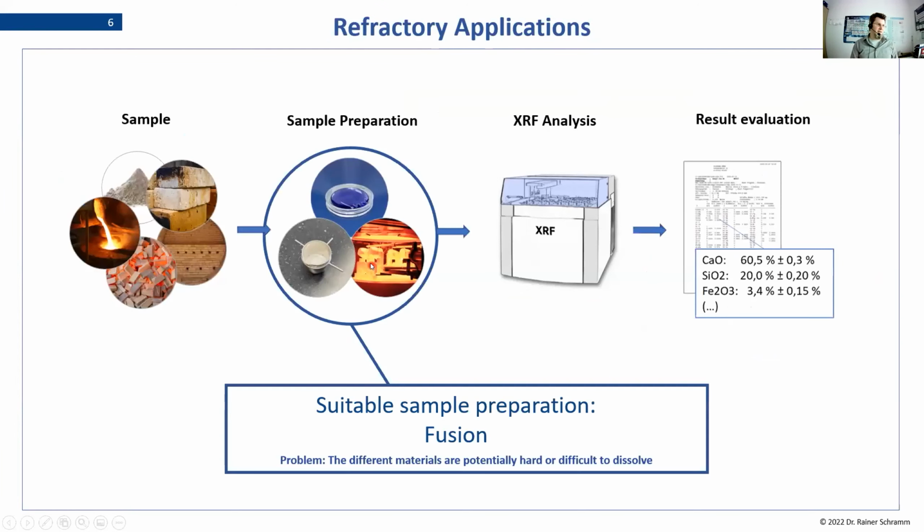So that's the chapter basically about the sample. So we have these refractories. It's quite diverse material, but in general, we're talking about a high temperature and highly mechanical, stable ceramic, let's say. And so the next question for us, if we want to do analysis on this now, we have to think about a suitable preparation method in our laboratory. And one suitable method that was found is the fusion, the dissolving in tetraborate and casting into a glass bead.